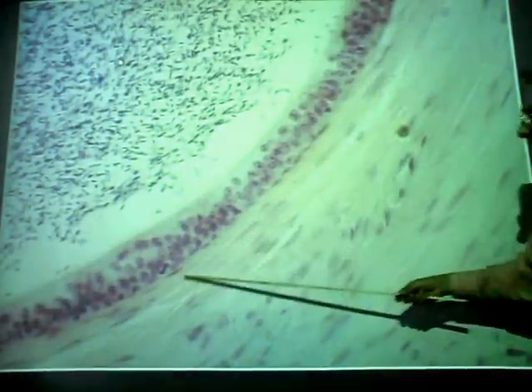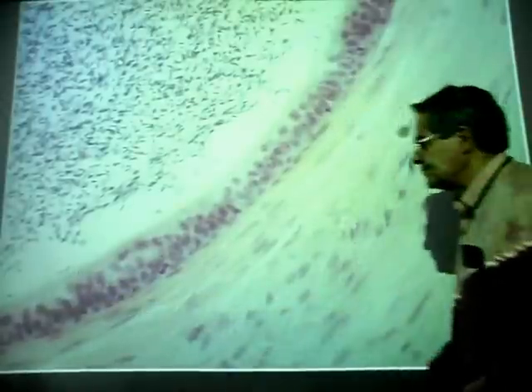Okay, just deep to that, or just external to the epithelium here, is what we've seen before. This is a mucous membrane. What is that areolar connective tissue known as? Lamina propria again. Then you've got your muscle layers out here. Now, if I ask the tissue, smooth muscle. The arrangement: the first layer here is longitudinal smooth muscle, like we saw on the wall of the urinary bladder. It's just the same arrangement.